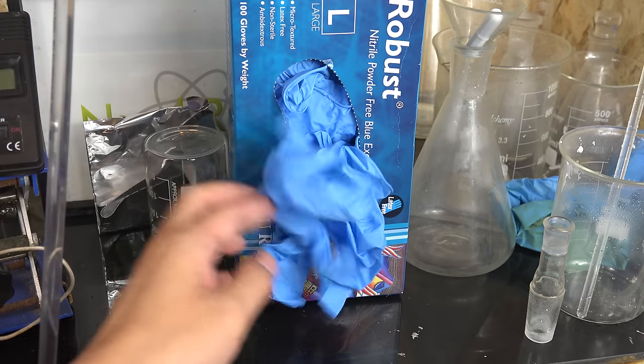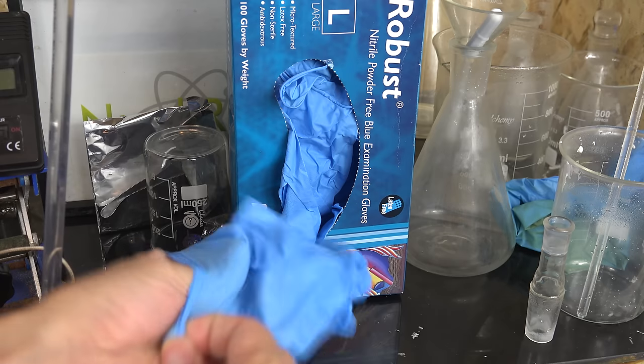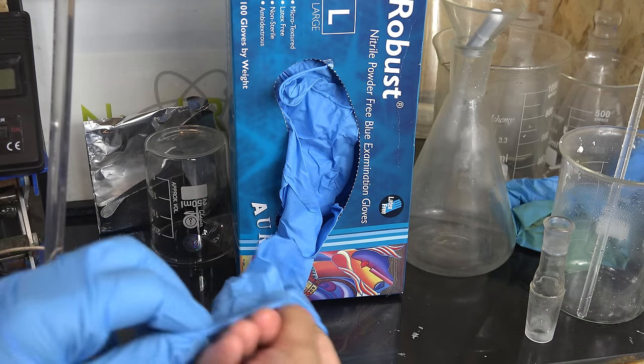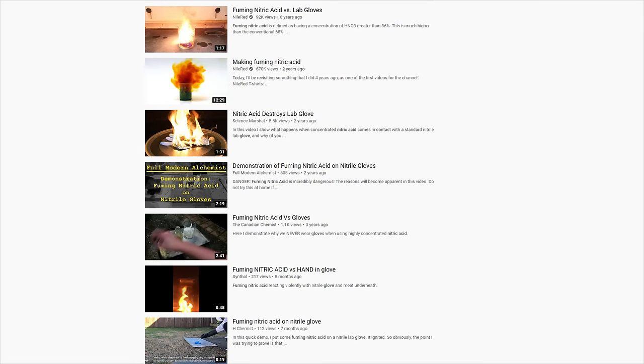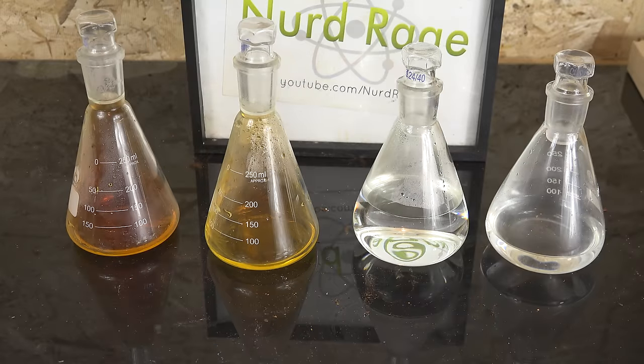So far I've been using nitrile gloves, primarily because I buy those in bulk and I tried to use the cheapest gloves that still give me adequate protection. But the problem that many commenters cite is that nitrile gloves react with nitric acid and catch fire. This is because the nitric acid I'm making in all of my videos so far is not the same nitric acid that sets nitrile gloves on fire. I'm making dilute nitric acid or concentrated azeotropic nitric acid. Nitric acid of those concentrations does not set nitrile gloves on fire. Let me demonstrate.